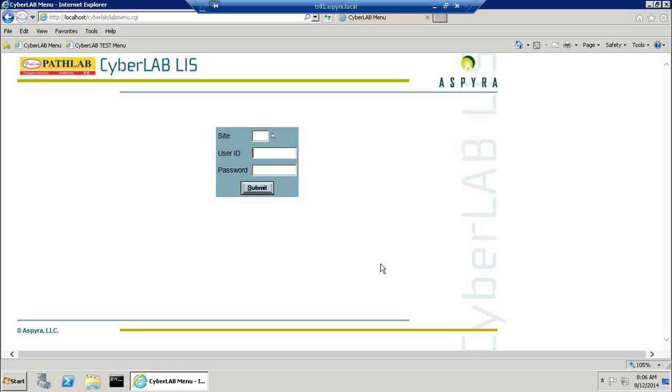The big menu that we're going to talk about today, and this is the one that should take the bulk of the meeting, is user class maintenance, and it's in your manual, and it's going to be an 8B. I may have sent you a separate section that's 8B6, which is just about user class maintenance. Otherwise, it's going to be on page 14 of the basic manual section. 8B is user class maintenance, and it is where the control for accessing Cyberlab is maintained.